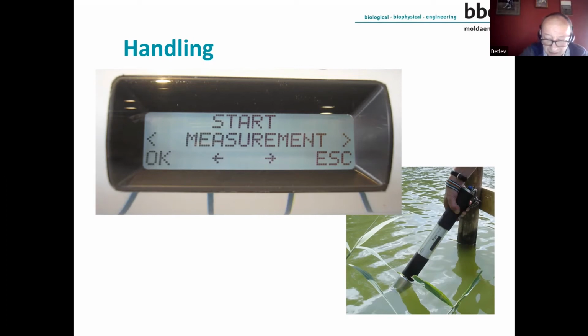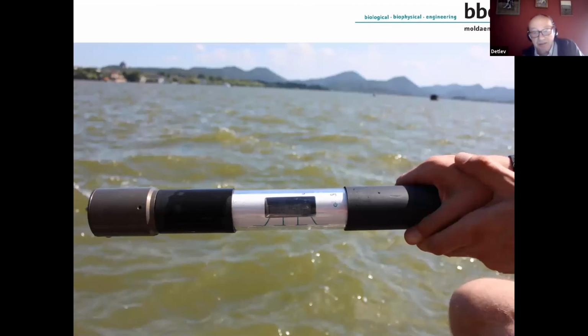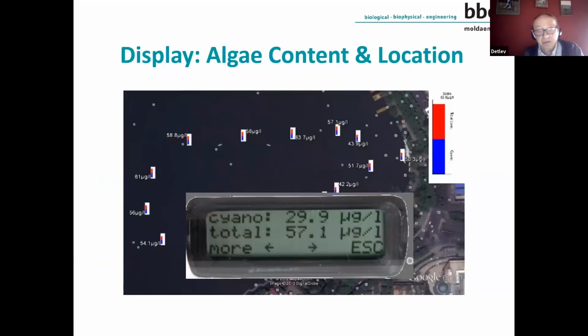So it may also be a useful instrument in unskilled hands, as you can see here at a lake in China, West Lake, close to Hangzhou, where the daughter of my colleague tried to determine algae. And immediately after, it takes about 10 seconds, you will get the results here on the display. And you can combine it also with the position from GPS.